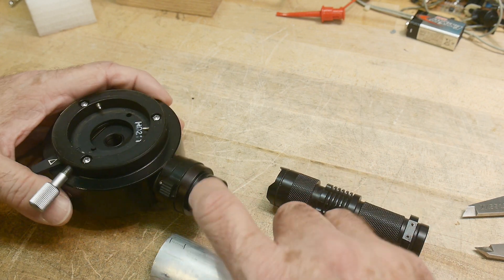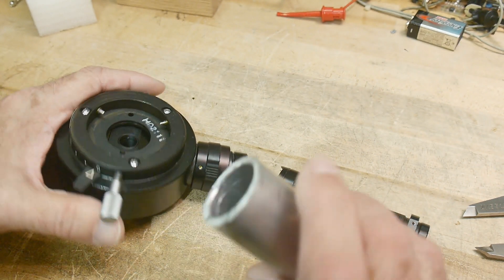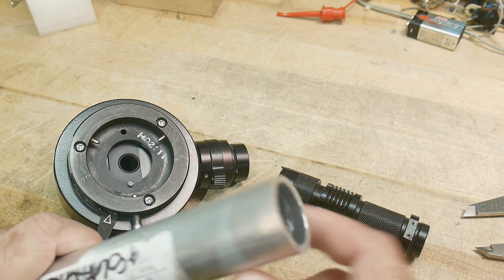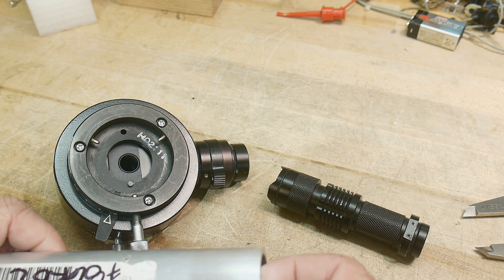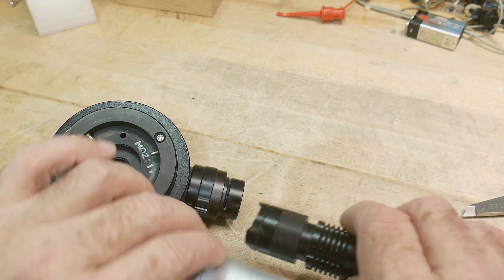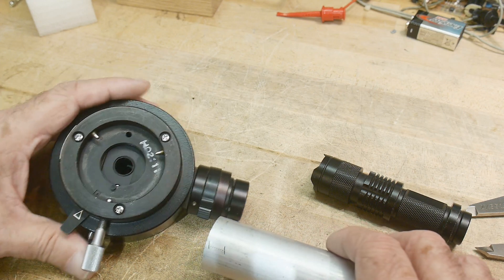There's a groove here for the set screws to bite into. So I'll put it in the lathe, dress the end, bore out the middle, at least get this part working, and then figure out how long I want to make it and attach the other end. Let's go do that.